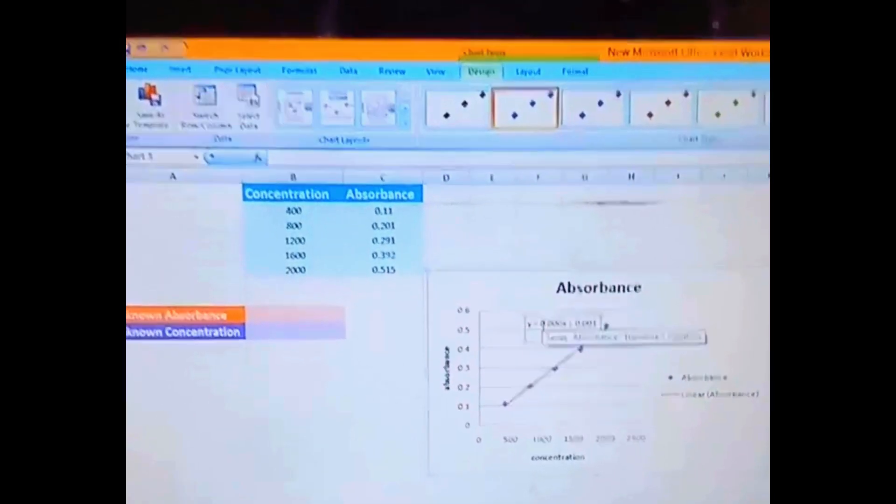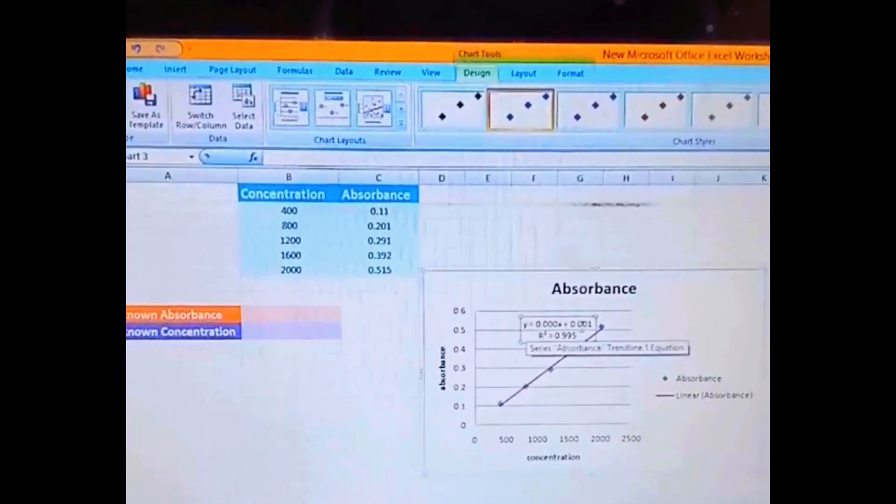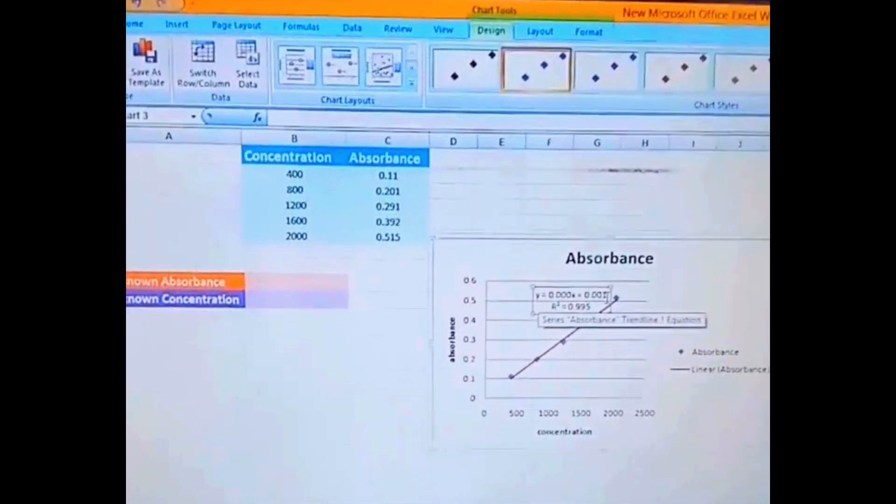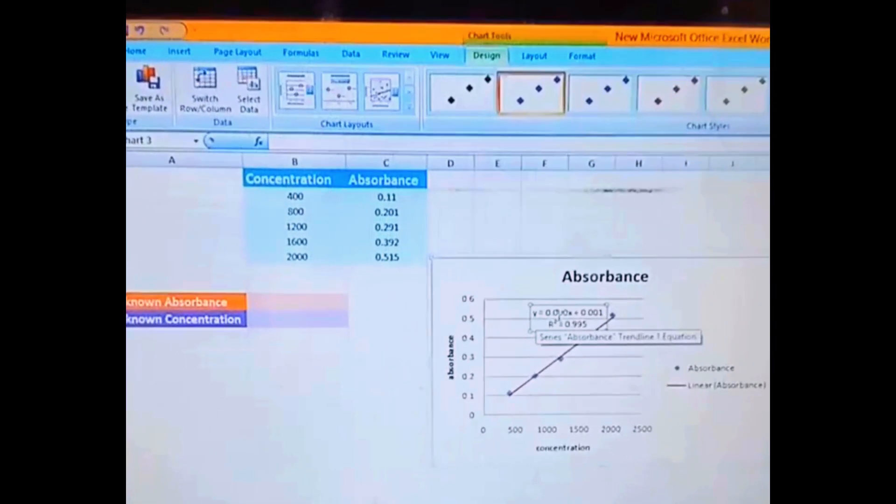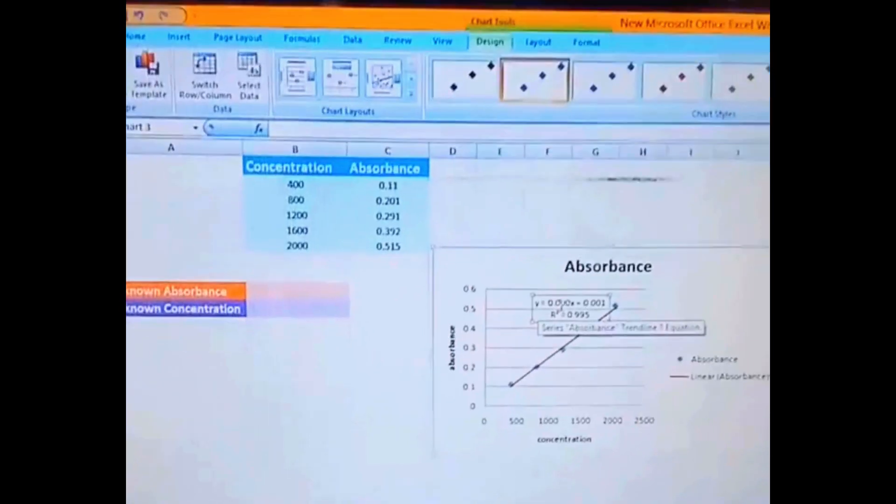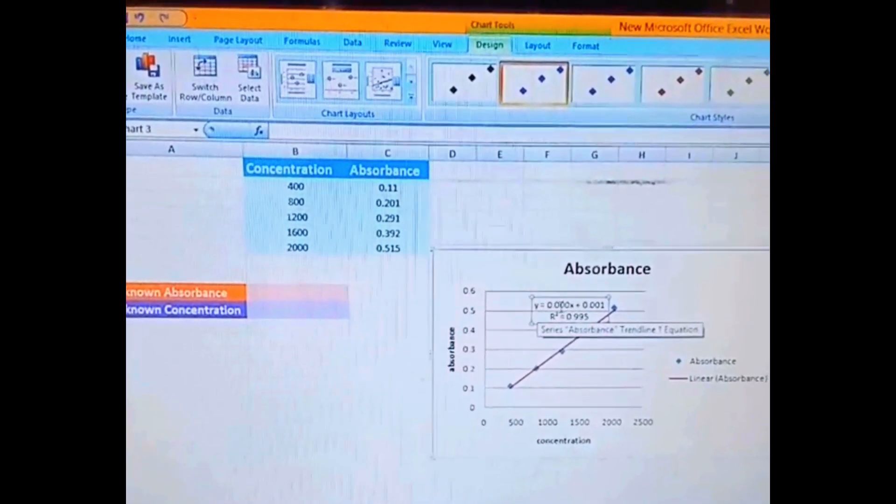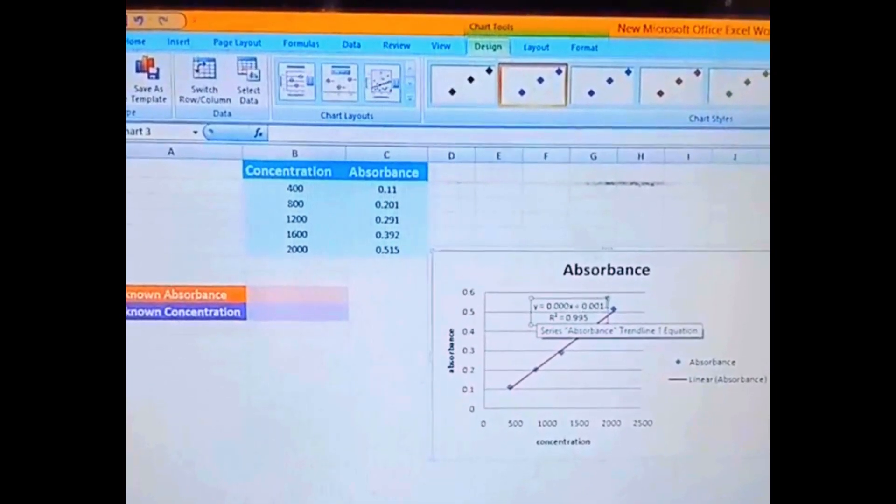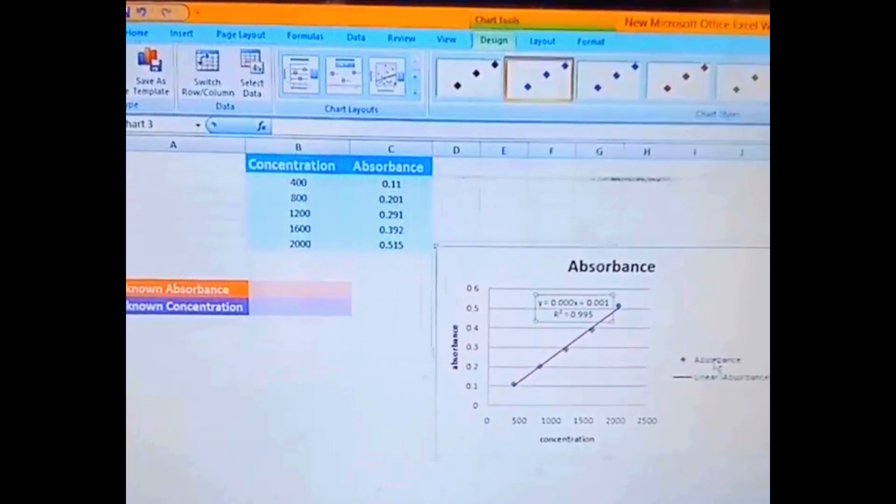And here I would like to mention that we know y equals mx plus c. The formula is here, or we can say ax plus b. So this value is the slope value and this one is the intercept value.